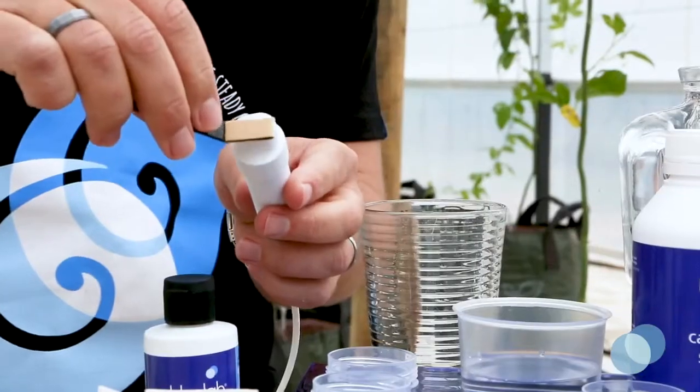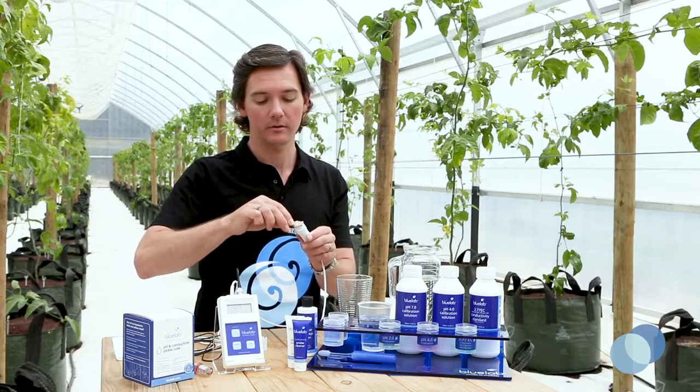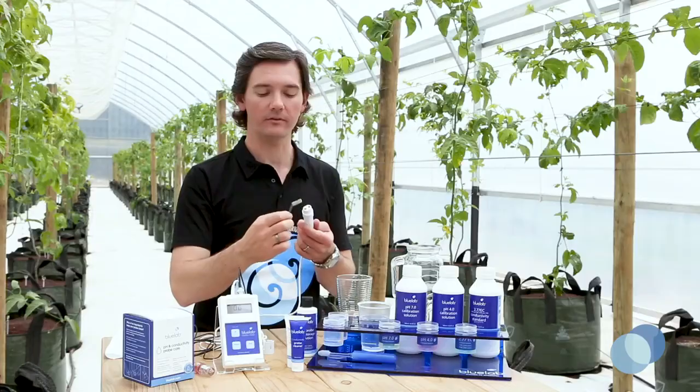Use the shammy to vigorously scrub and clean the probe face. You can use the other side of the shammy to wipe off any excess cleaner from the probe face.